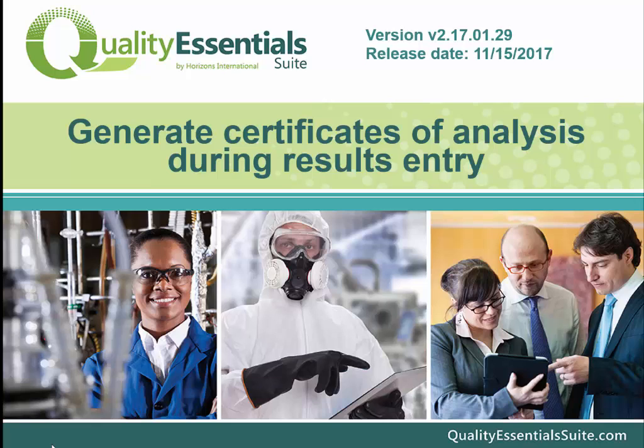This presentation is part of our series of videos explaining features and enhancements found in the most recent release of Quality Essentials Suite. We refer to it as version 17. In this video, we will demonstrate the ability to generate Certificate of Analysis reports using the recently introduced pop-up forms. These forms have been added to enable the user to generate their Certificate of Analysis documents without needing to exit their current data entry processes.